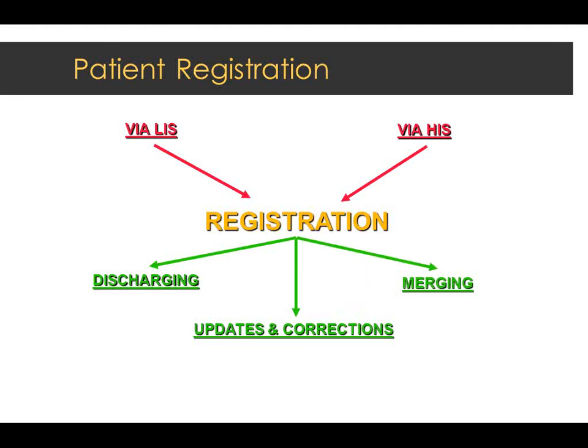So a patient comes in as a John Doe, comatose, comes into the ED, don't know who he is, she is, need to do that. And then once we find out who actually the patient is, if they've got a medical record already, we need to now merge those records. That's a tricky process, and you got to make sure you do it right. Because once you merge data, pulling it apart is almost impossible. So we have checks and balances on that to make sure that, when we do a merge, it is correctly done.